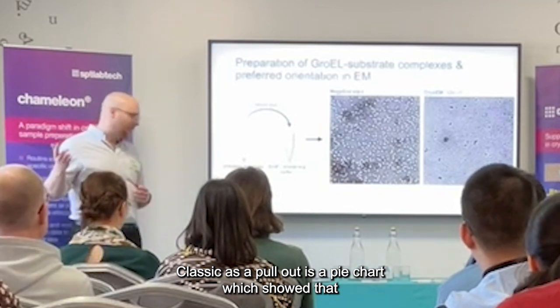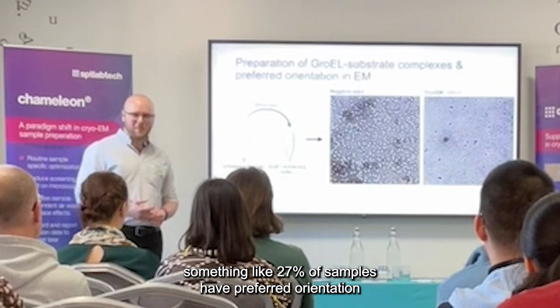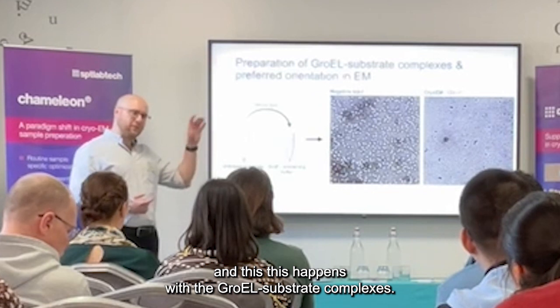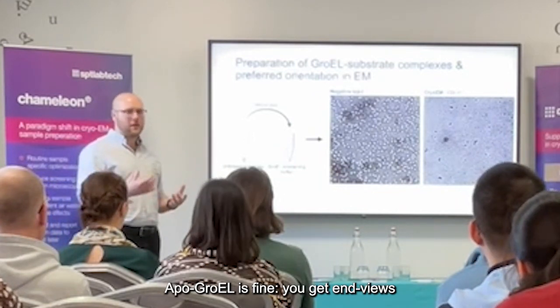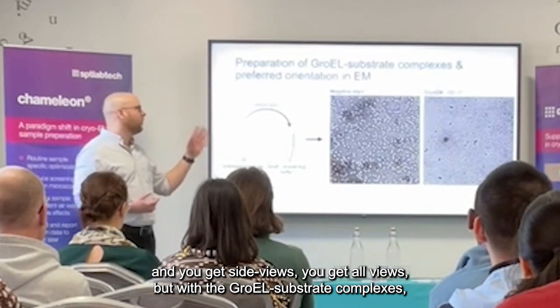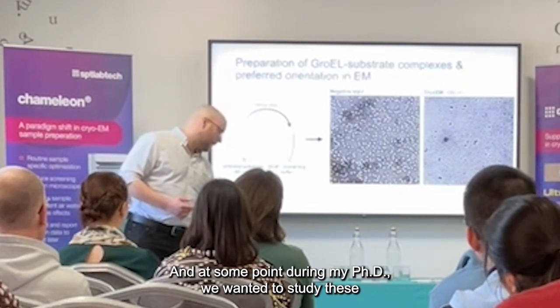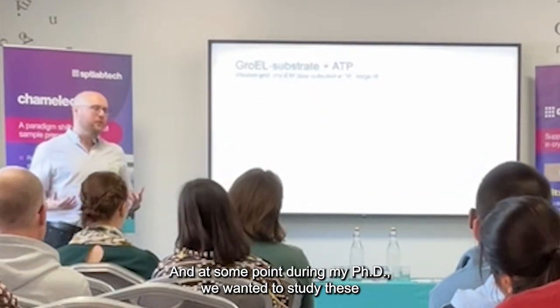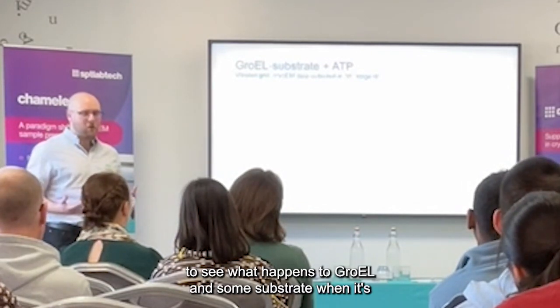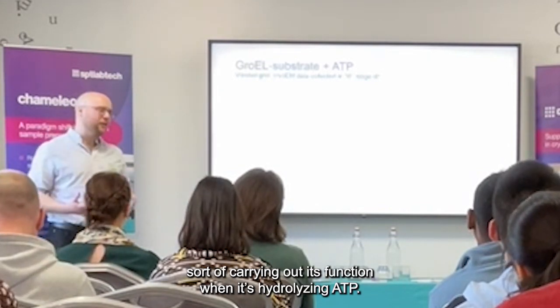Classic — as Paul showed in his pie chart, which showed that something like 27% of samples have preferred orientation. This happens with the GroEL-substrate complexes, but apo-GroEL is fine — you can get end views, side views, tilted views and everything — but with the GroEL-substrate complexes, it's just a very strong orientation. And at some point during my PhD, we wanted to study these GroEL-substrate complexes in the presence of ATP, and we wanted to see what happens to GroEL and what happens to the substrate when it's carrying out this function when it's hydrolysing ATP.